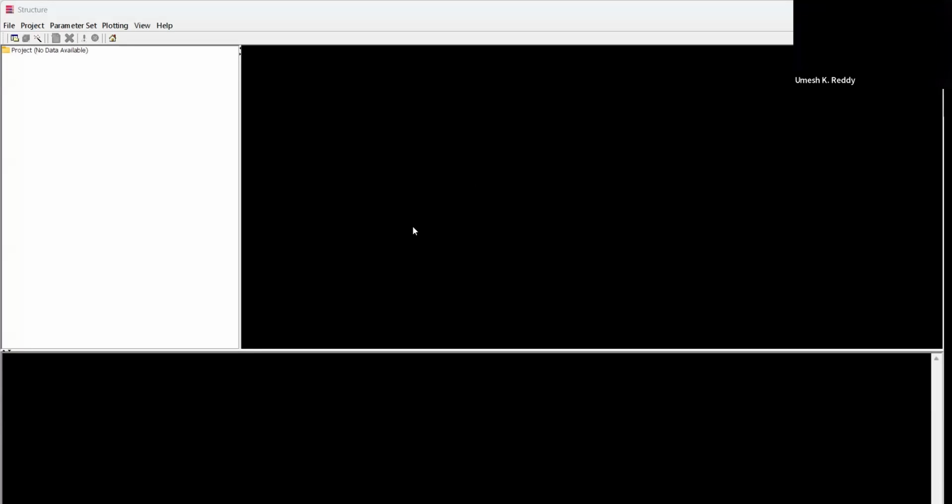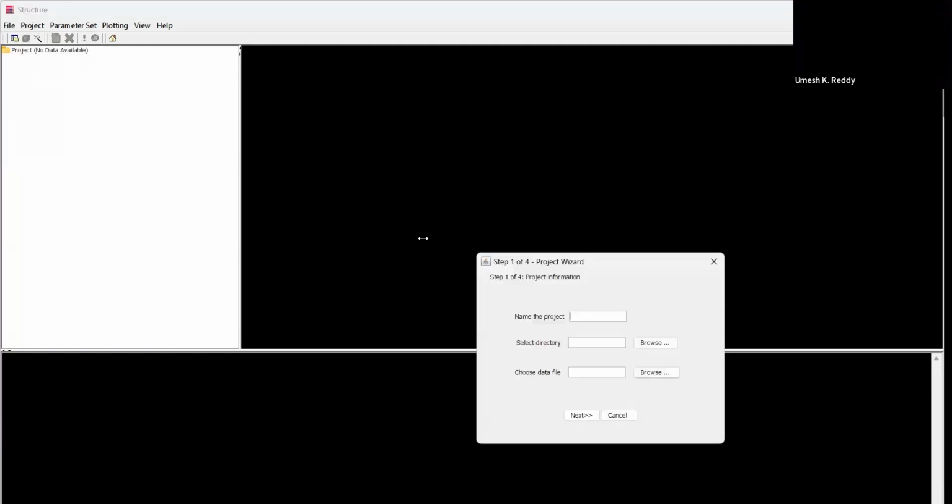So students, this time we are running Structure for population structure. In Convert, we had created a file with structure format that will have the str extension. Okay. So for creating structure, I opened here the Structure program. As I said, all of this can be downloaded. And also we loaded it onto your computers, so you already have them.